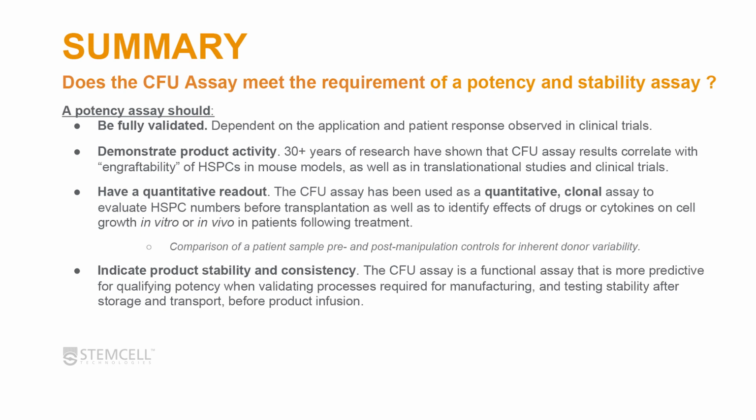When you look at one of the criteria for a potency assay being that it should indicate product stability and consistency, I think that's a resounding yes for the CFU assay. As I've shown you, there are a lot of papers where, whenever they're evaluating a new possible potency assay, or want to make sure that whatever modification or storage condition they've used is actually working, the CFU assay is typically the assay that they use to validate their processes.